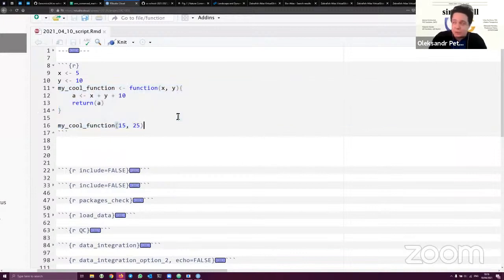So this is actually the very basis of any library we create, or sorry, we import. So why do we import Seurat, why do we import any other libraries? Because they contain functions, which can be such simple ones or can contain hundreds of code lines. And well, that's the reason why we do this, because of course we can do everything without any libraries, but still we would need to write thousands of lines of code, which is not always an optimal solution.